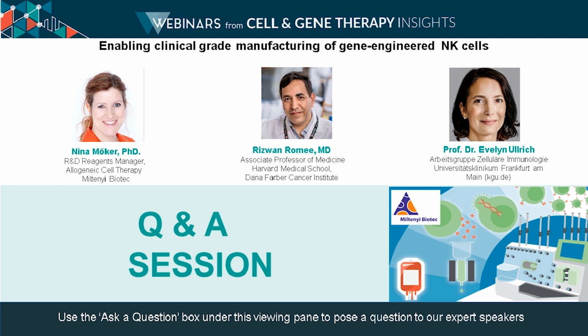Another important point is that all ingredients have to be GMP compatible. So to already set up the research use only processes with reagents that are available as GMP. And then I believe another very important challenge is the timing of the manufacturing. So to reduce the steps which require actually people in the clean room as much as possible, because everything takes like at least 3 times as long in the clean room as compared to the normal lab.